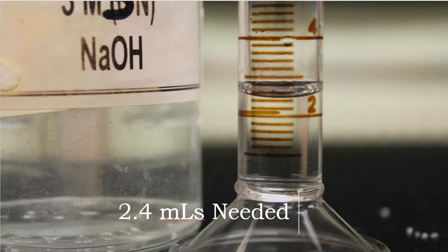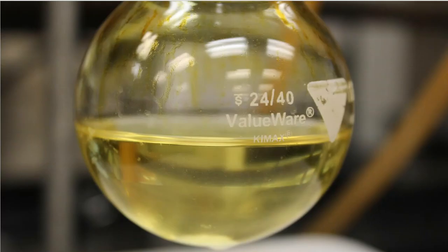Sodium hydroxide, the lab directions tell me 2.4. Once more, I'll just use a graduated cylinder. I'll pour out 2.4 milliliters of sodium hydroxide, and I'm getting ready to add these OH groups to my molecule. All right, so I go back to my boiling flask. This is what it looks like at this point.